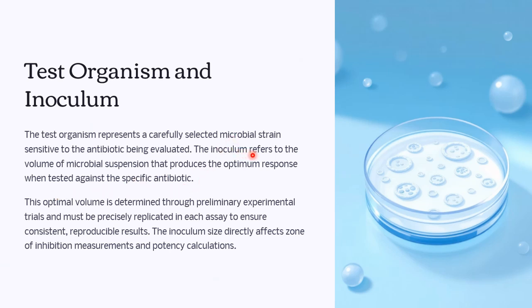That is, the concentration of inoculum refers to the volume of microbial suspension that produces the optimum response when tested against the specific antibiotic. This optimal volume is determined through preliminary experimental trials and must be precisely replicated in each assay to ensure consistent and reproducible results.